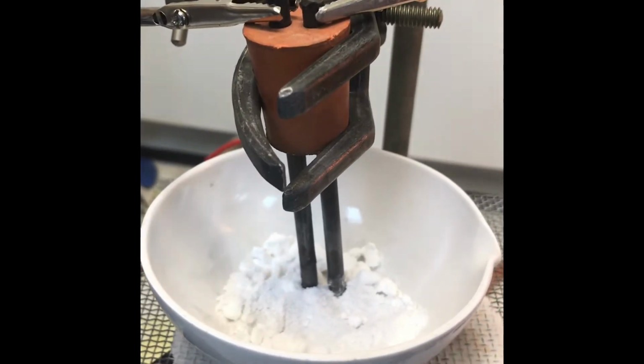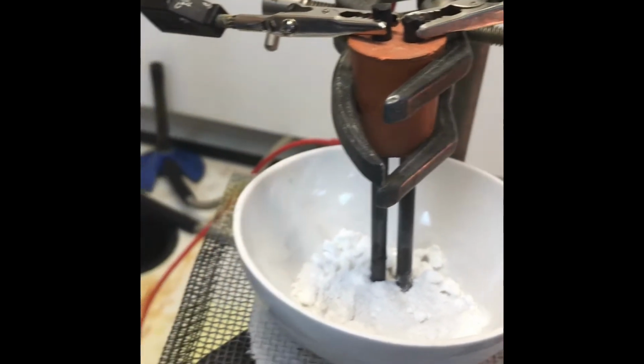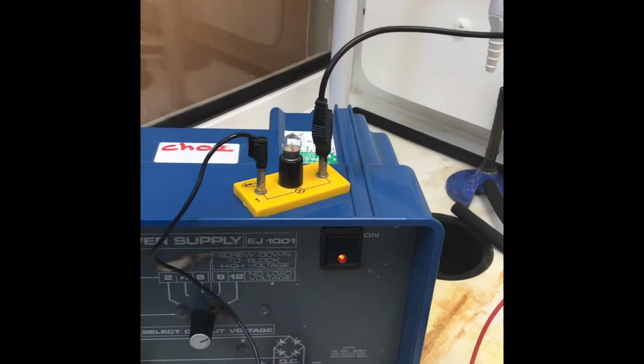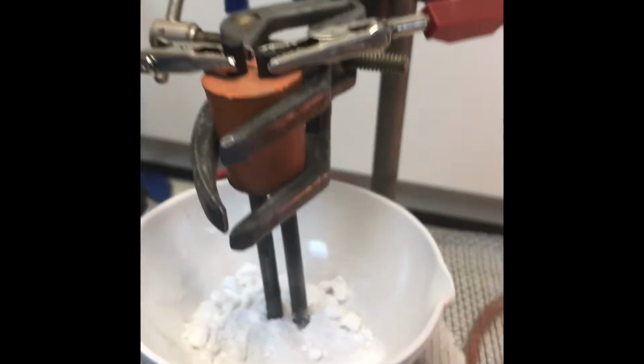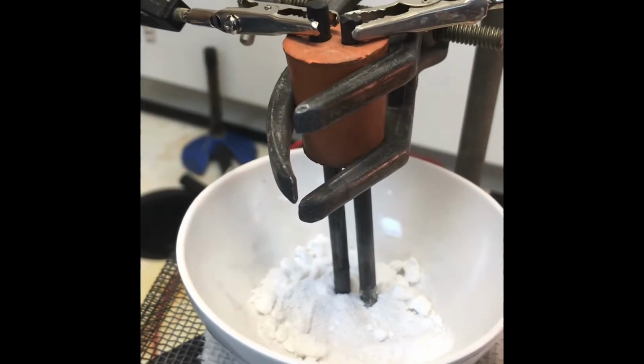So at the moment I've got solid lead bromide in the crucible here. It's connected to a circuit and a 12 volt power supply. There's a bulb in the circuit, and as we can see at the moment the bulb isn't lit because the ions aren't able to move in our particular ionic compound, lead bromide.